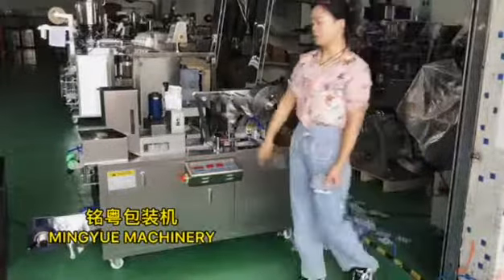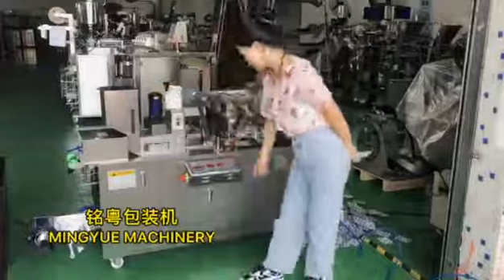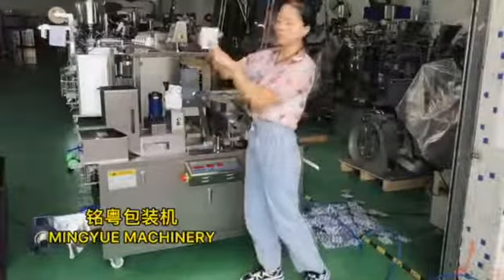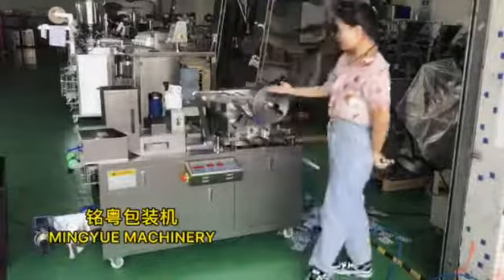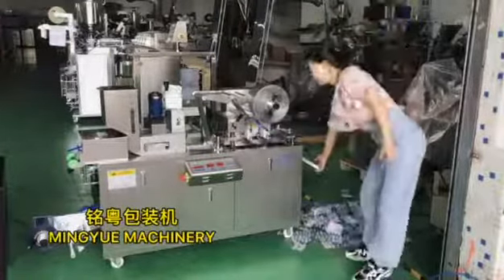The machine has four core states. The first state is PVC forming. The second state is to put the material in the PVC forming. The third state is the aluminum foil sealant. The last state is the cutting.